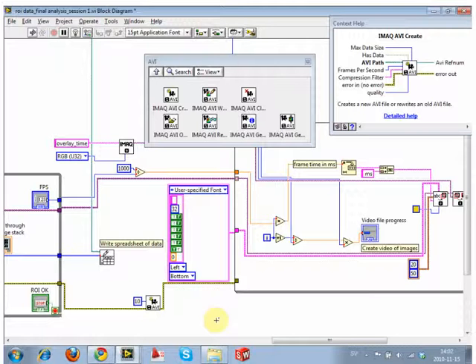Same thing with TIFF kind of files. You can make a video from a TIFF style compression, and if you save something in Photoshop, you have the same option, like how big a file do you want it to be. It's the same kind of thing, a 0 to 100 category, 100 being do the minimum you can, 0 meaning brute force, make it 1 pixel kind of thing. I would recommend in almost all situations you don't compress. If you have particular compression needs, we can look at it on a single point basis.